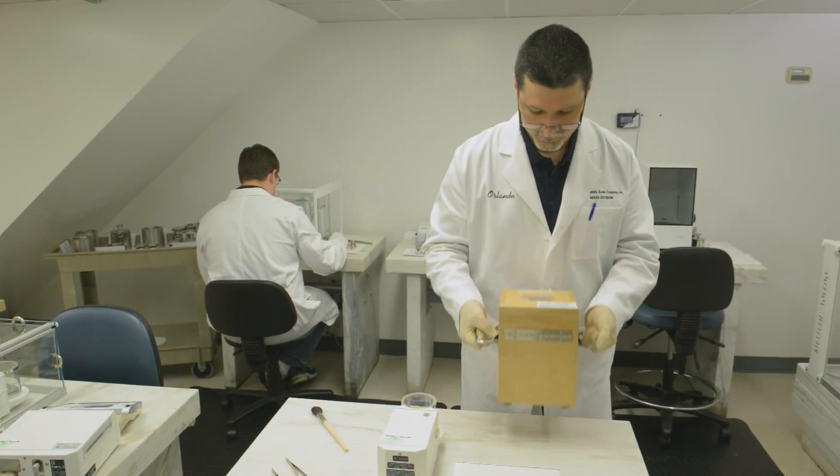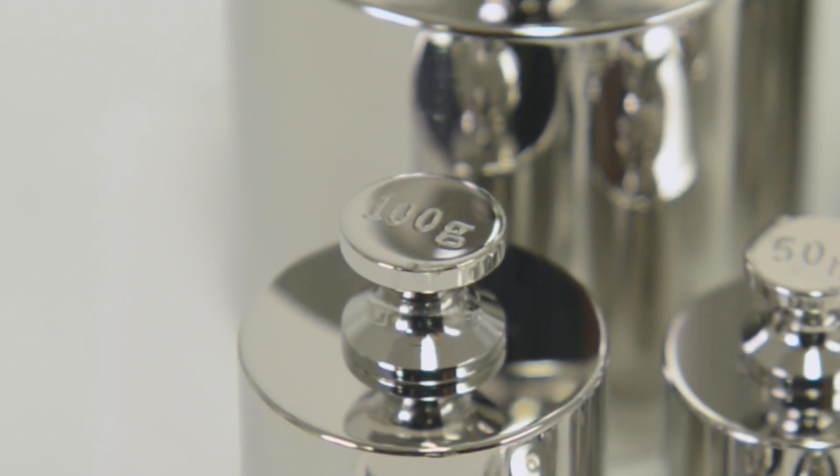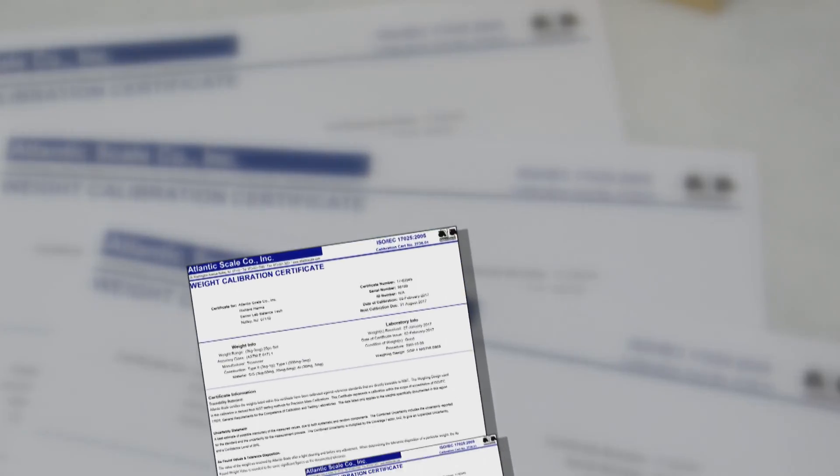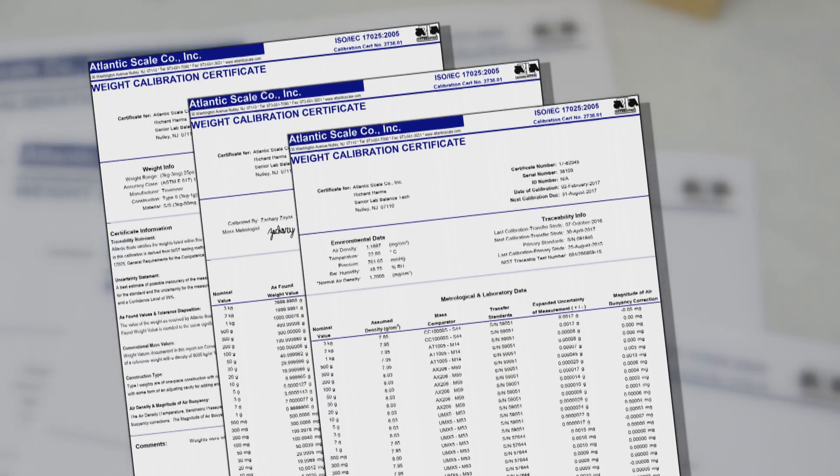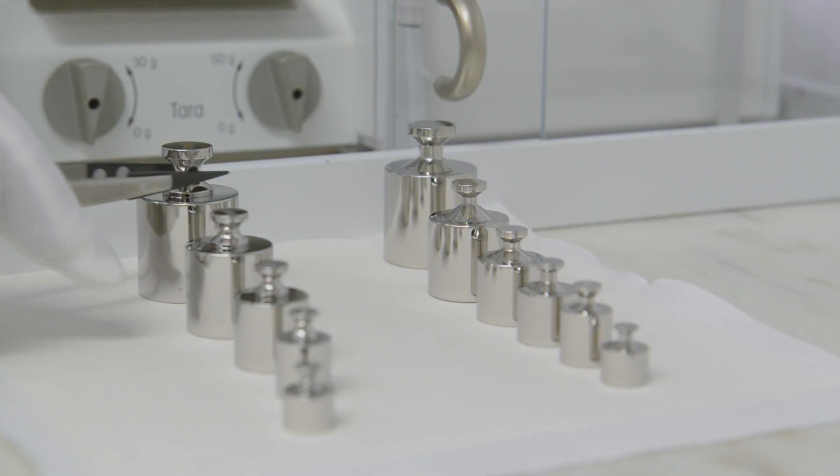This gives the capability for calibrating ASTM class 1 and even class 0 precision weights. NIST traceable calibration certificates providing detailed calibration data are furnished with every weight calibration.